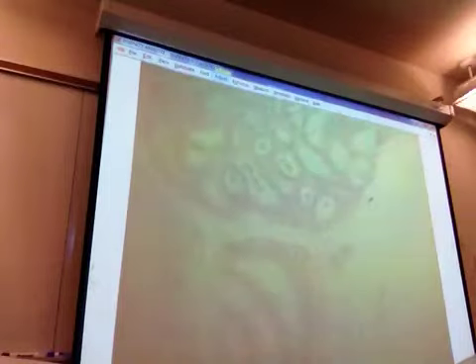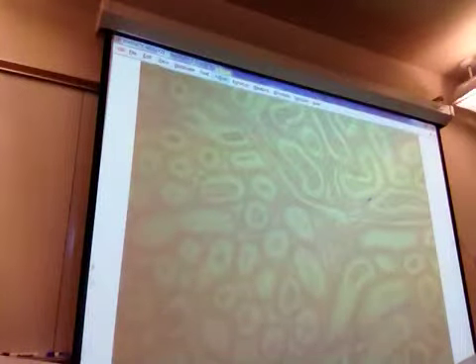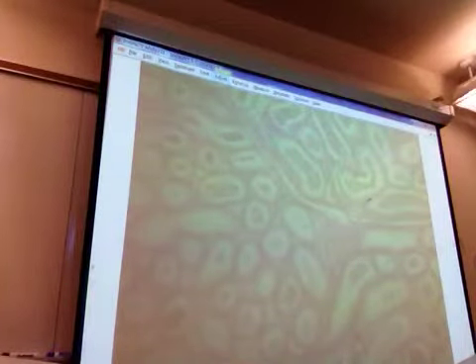There's not a whole lot of sperm on this slide, so I will show you epididymis though as a contrast. Notice epididymis looks a lot rounder, not so much like prostate.